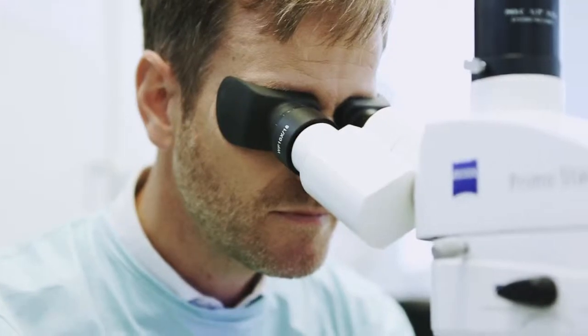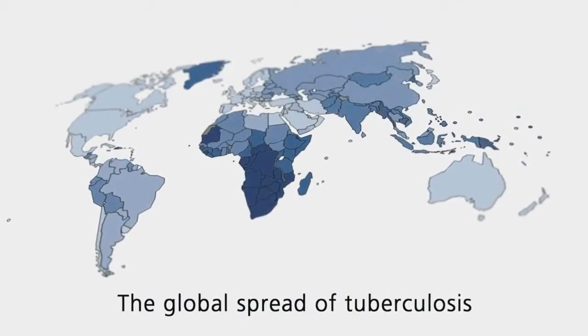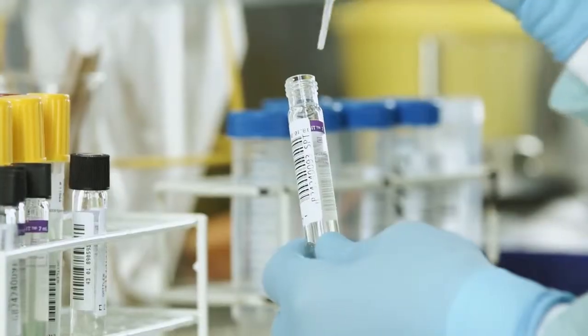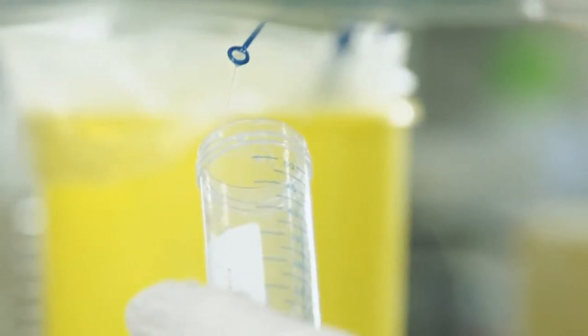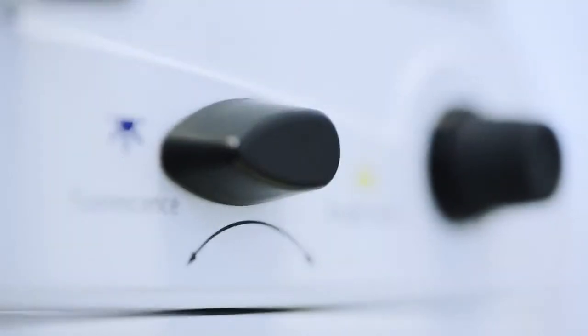I'd like to tell you how fluorescence microscopy techniques can help you combat tuberculosis, one of mankind's most serious infectious diseases. Most cases of tuberculosis affect people in developing countries that have only limited financial resources, but which need a simple method for verifying pathogens both quickly and reliably. We are active in these regions as a WHO reference laboratory using fluorescence microscopy to accurately identify the disease.